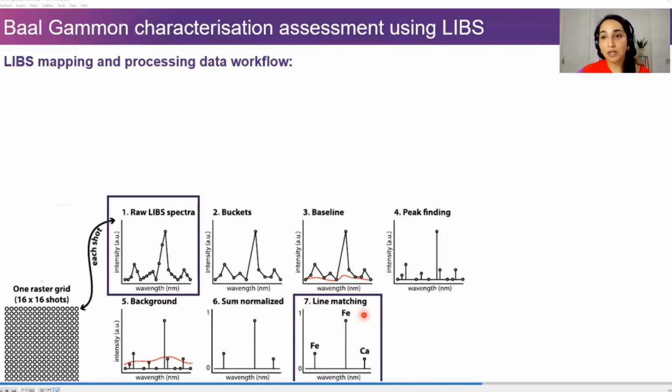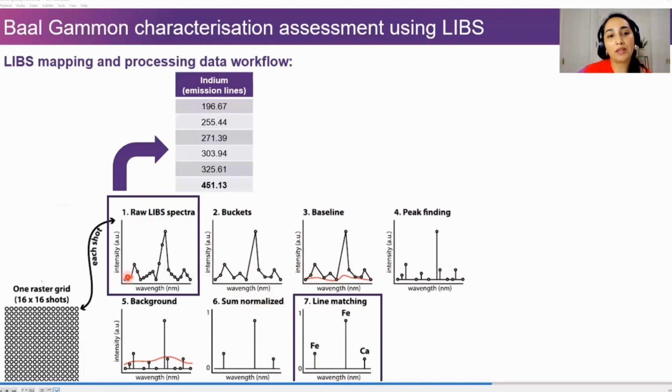But sometimes indium is not necessarily recognized as high relative abundance. So two ways were taken to work with the different outcomes from LIBS and try to understand and interpret the semi-quantitative information from drill core samples. The first one, from raw intensity data, is to recognize which kind of emission line from indium could be useful in terms of geological and mineralogical context. Firstly, this specific model C300 SIAPS has six emission lines for indium in its library, and specifically 451.1 is a really good emission line for indium in this specific deposit.